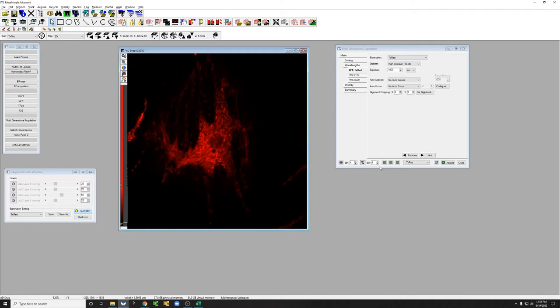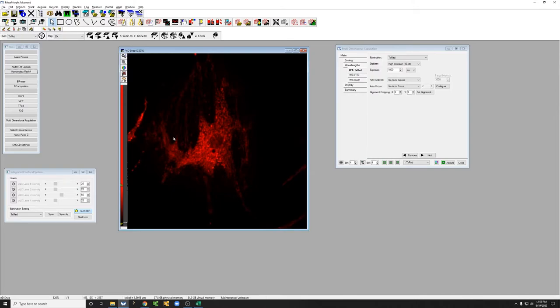As far as these other buttons go, I would recommend you don't touch them because if you do, you can totally screw up whether the field of view on the Hamamatsu camera is aligned to where the laser is flattest, and I can explain what that means if you're interested individually.